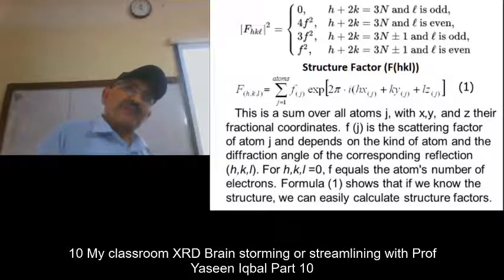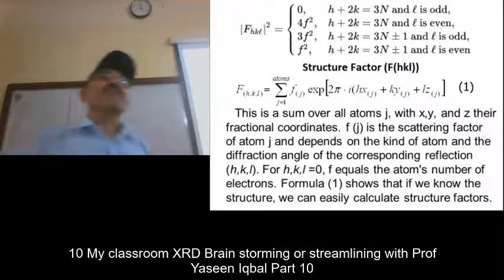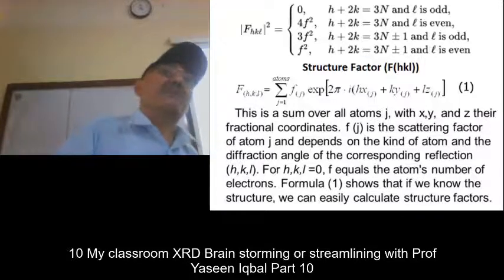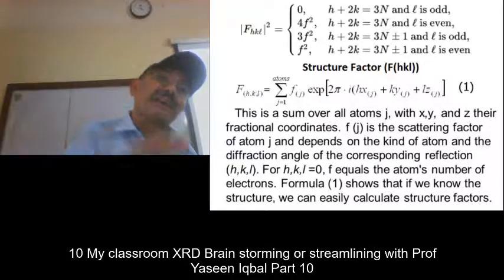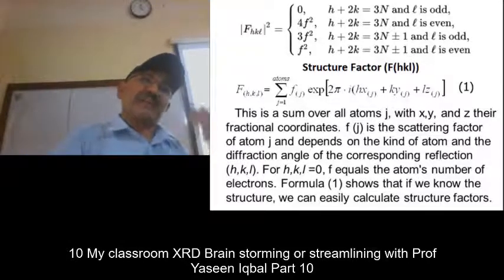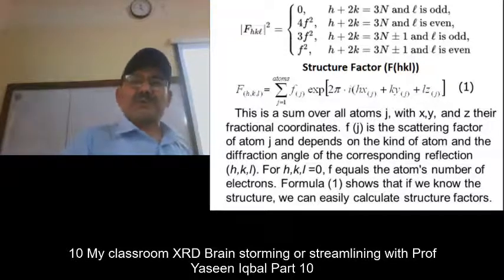So when you are doing metallic samples, then you need an X-ray beam with a specific suitable energy so that it is not absorbed completely and gives you the diffracted beam. So that is why different sources of X-ray, copper, molybdenum, and many others are used for various samples.